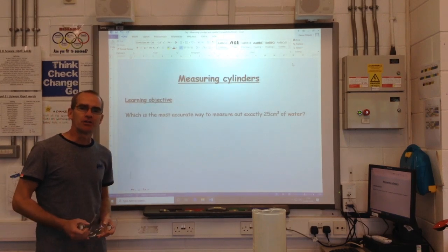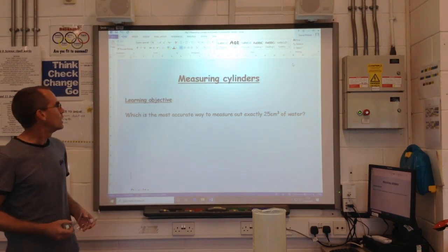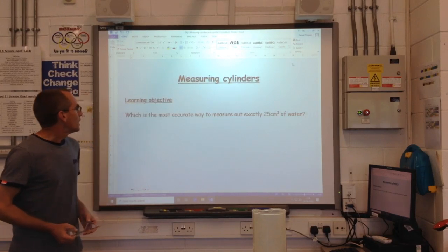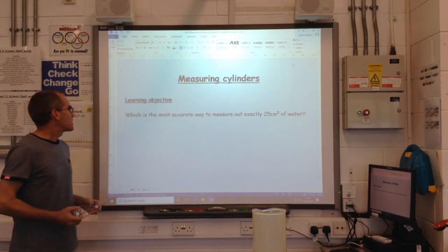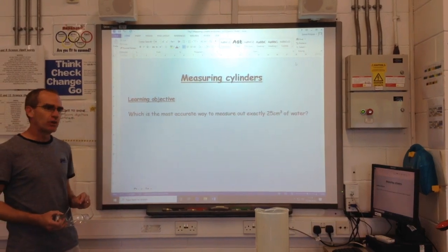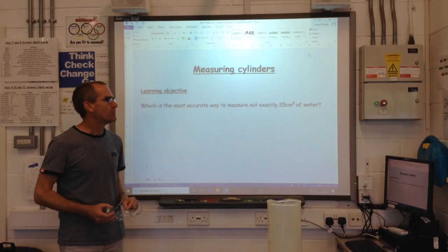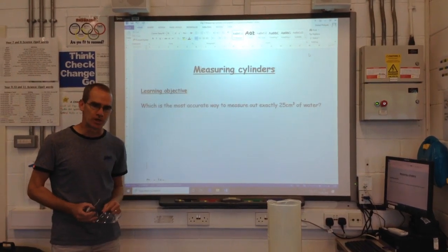Hi everyone, welcome back — this is the Redbridge Science Channel. Today we are going to be talking about measuring cylinders. My objective today is I want to know which is the most accurate way to measure out exactly 25cm cubed of water.